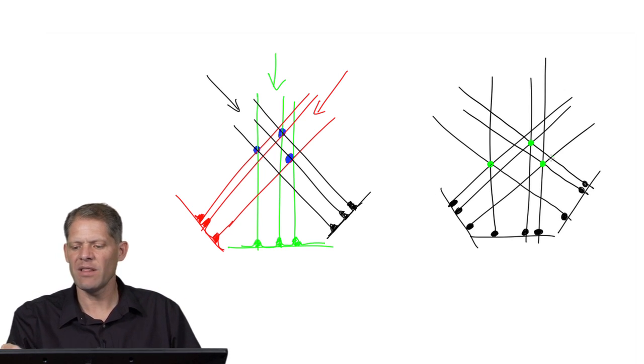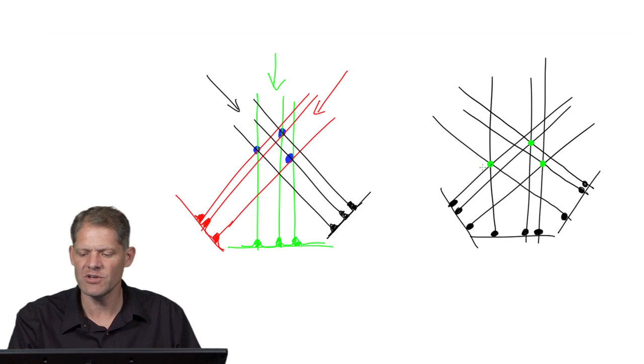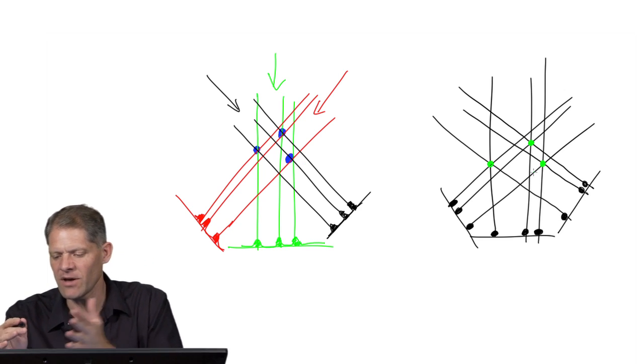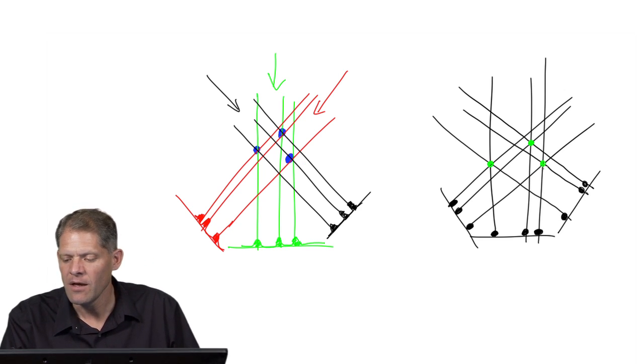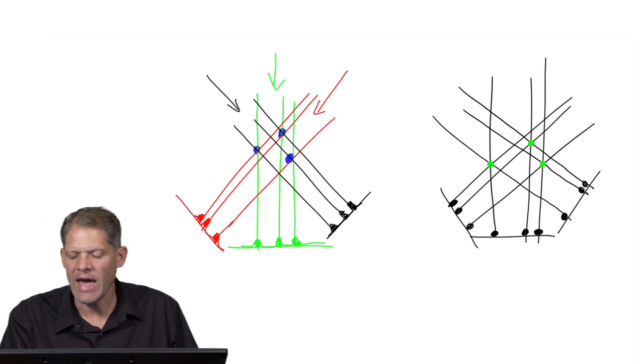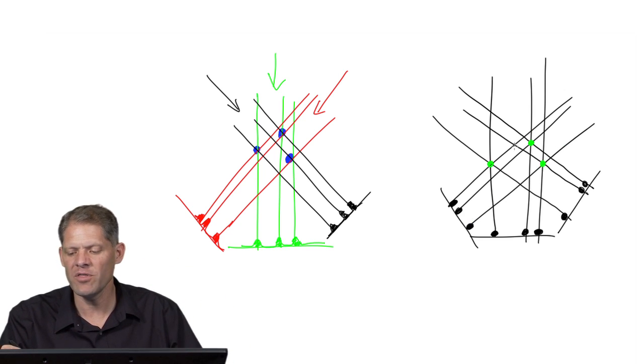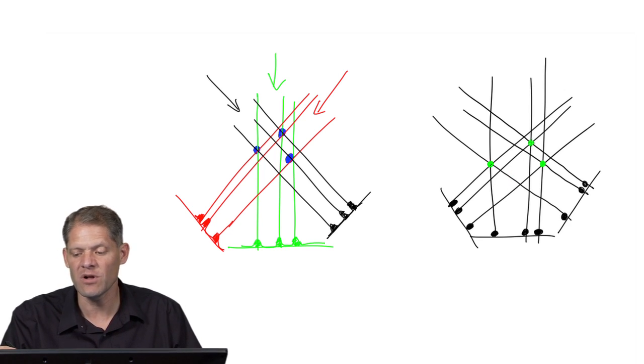And if I had drawn my lines just right, you would see that these positions match well the original object. It doesn't quite match because I couldn't draw them exactly right. But the concept is clear. The locations where all of the projection images have density rise above the noise of all the other artifactual intersections here and reveal themselves as the positions of the real components.